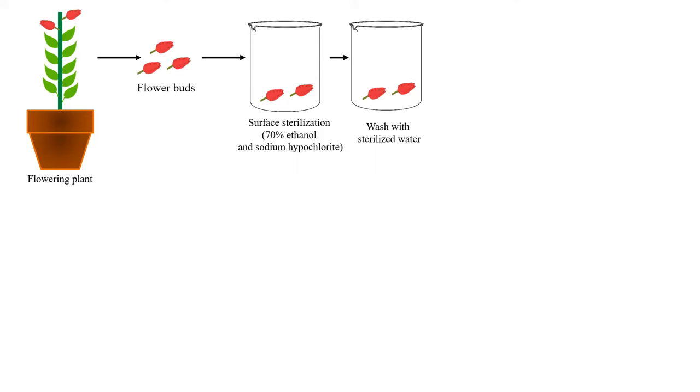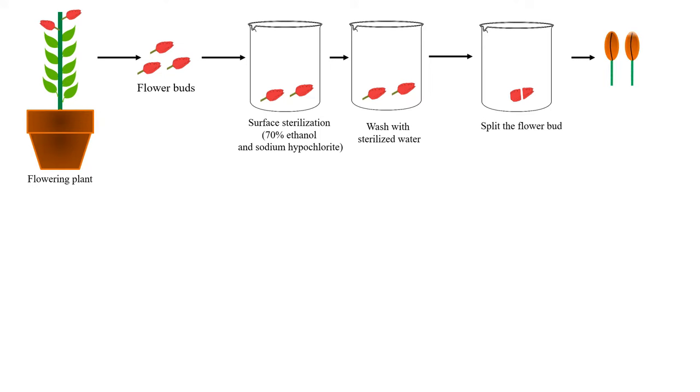After sterilization, these are washed to remove the residual surface sterilization agents like sodium hypochlorite. We wash these flower buds with sterile water. Then these flower buds are cut with a knife to split them open.